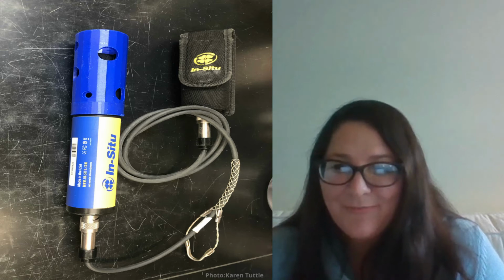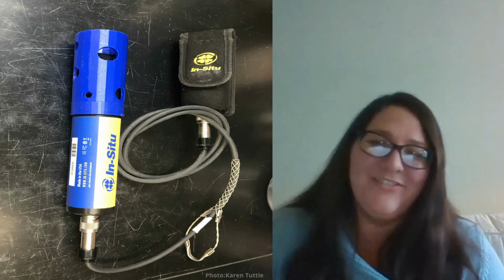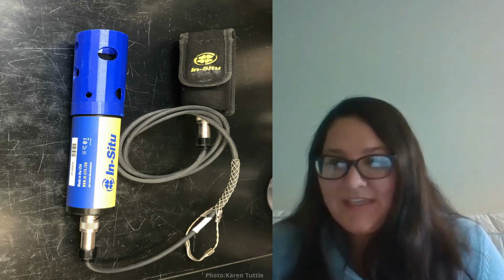So we use ones that are used for ocean monitoring. They're kind of beefy looking sondes that we will take and put into our exhibits, and get measurements on things like dissolved oxygen, pH, the conductivity, which can be converted to salinity pretty easily, on our systems that we do spot checks on. We also have probes that are built in situ into our system, so we can get that data instantly. It goes to a big control system. We can get alarms that are sent to everyone's cell phone if something is off, and so we have both of those sorts of things.